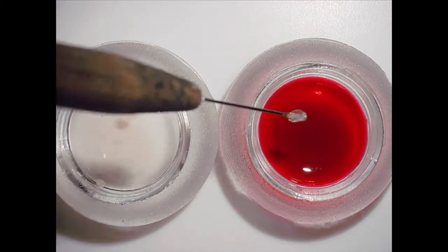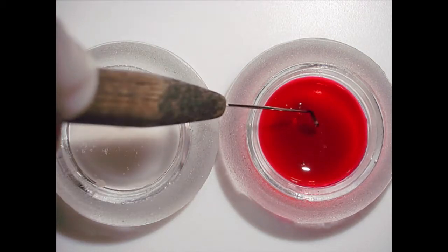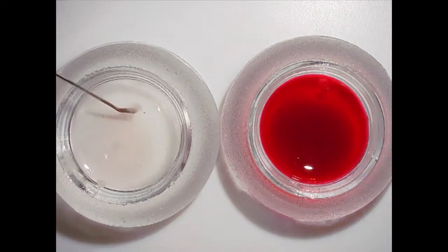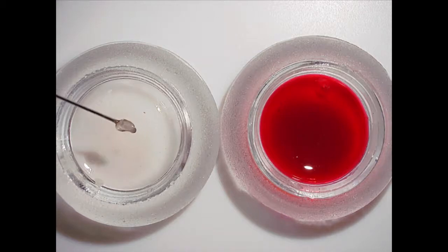We're moving this to a double stain. This is commercially available. This contains acid fuchsin and lignin pink. The beauty of a double stain is you can't overstain the specimen. You'll notice there's some bubbles developing in that specimen about 12 o'clock. I'm getting a second specimen here. Again, come under the specimen with your spatula. Just move it across to the double stain.